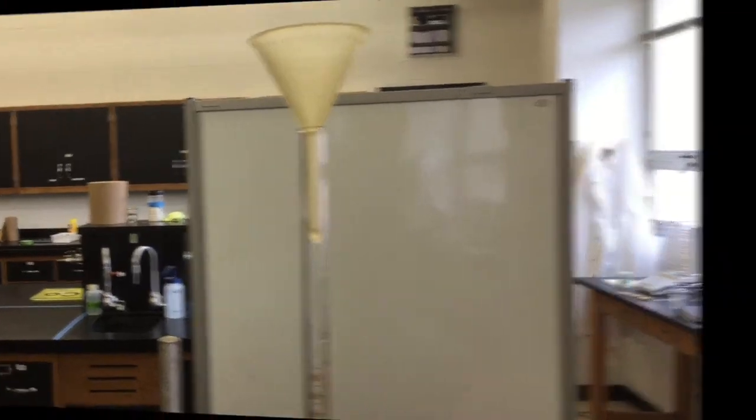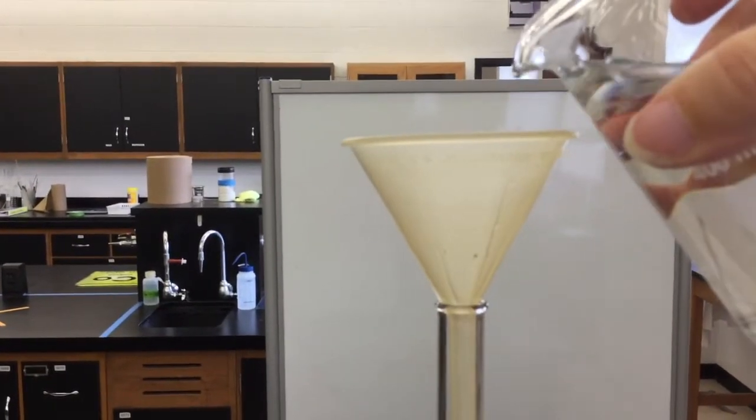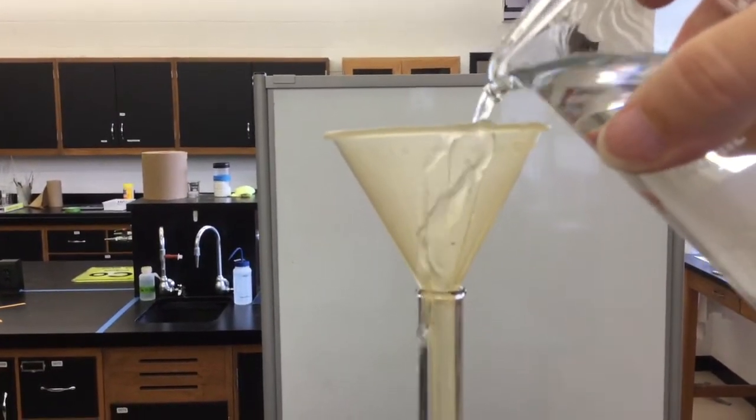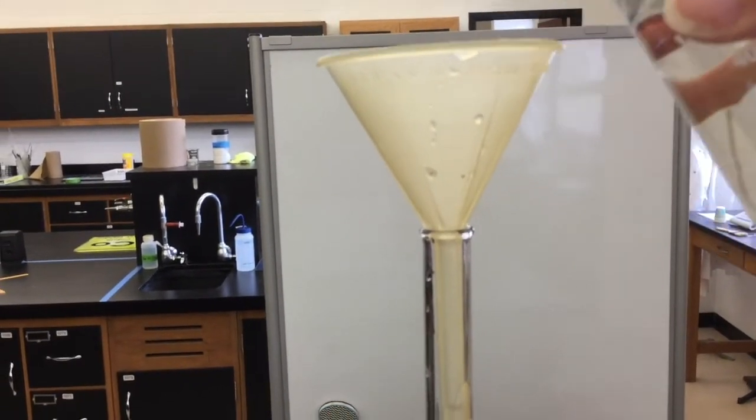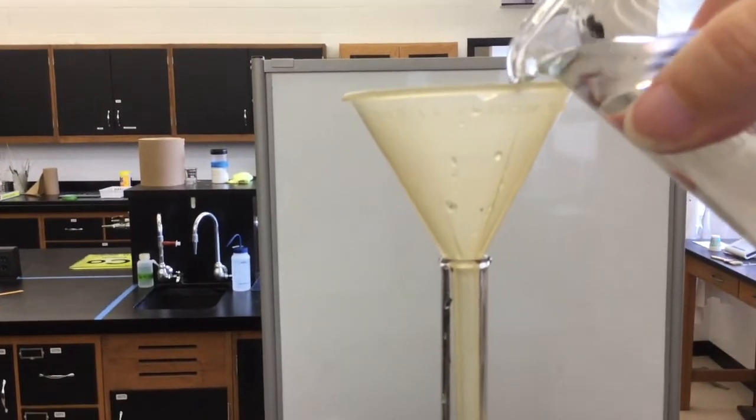The exact amount isn't important. Next you will add 50 milliliters of tap water, plus a little extra, bringing it right up to the brim. Some will spill out as you add your magnesium, and this is okay.